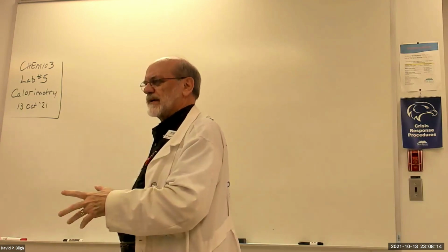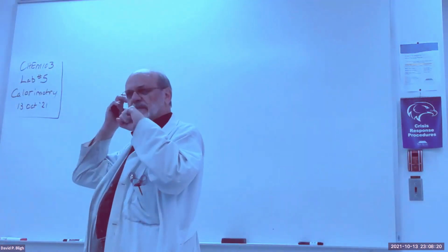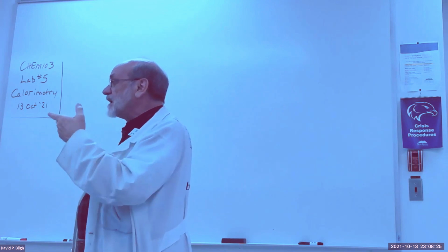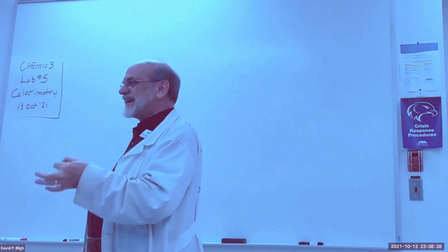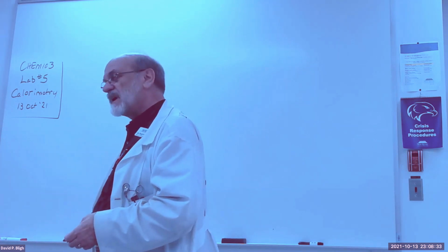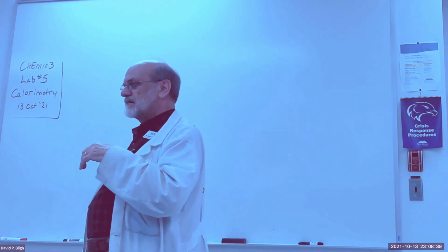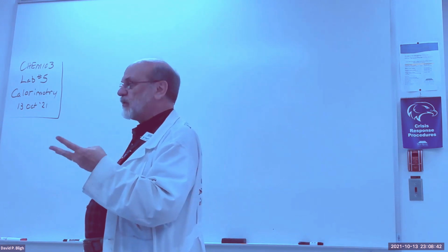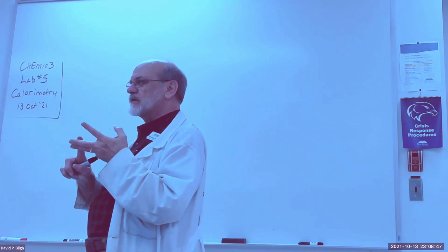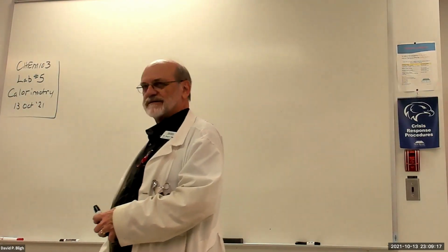So overall, what are we trying to accomplish with this exercise? We're trying to determine the heat, calorimetry, measuring heat. We're going to measure the heat transferred, produced or absorbed in various processes. In fact, we've got 3 processes. We're going to do an acid-base reaction. We've got 2 heats of solution. One is sodium carbonate in water. It's temperature balanced.